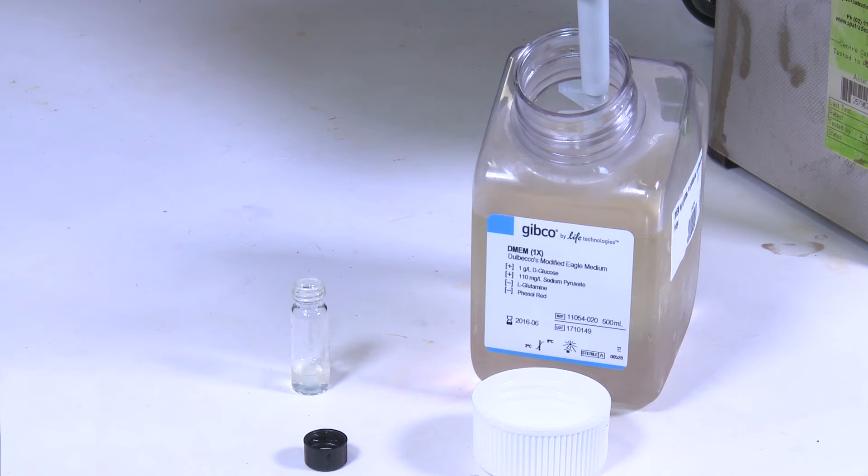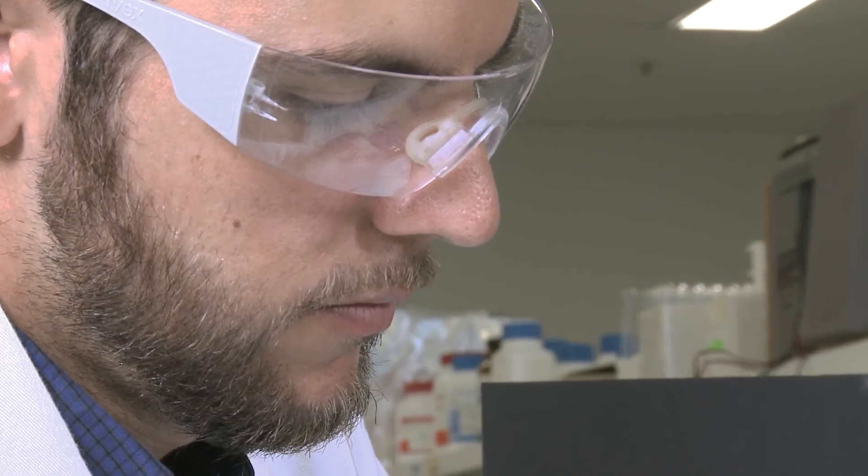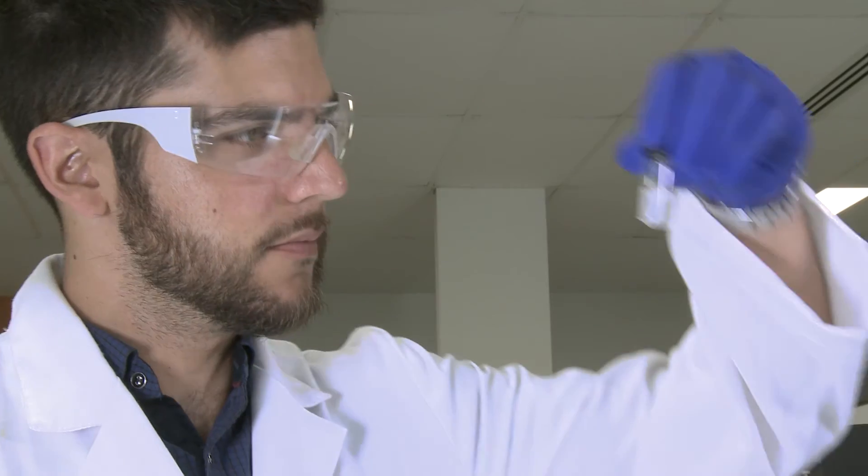Secondly, we'll perform a solvent switch. We prepare the solution as before but this time we add an aliquot of cell culture medium which screens the charges on our gelator and forms a gel.